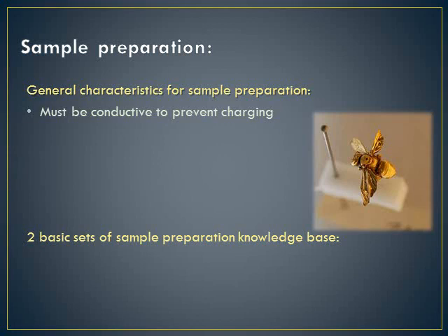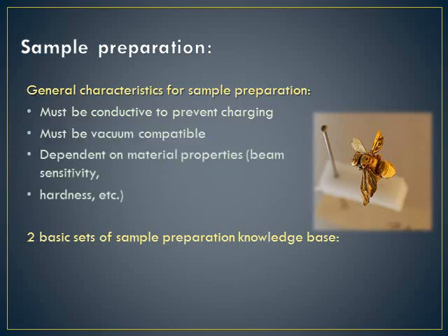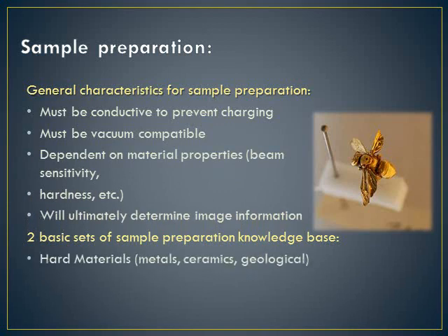Fixation is usually performed by incubation in a solution of a buffered chemical fixative, such as glutaraldehyde. Coating. Most samples will need to be coated to make them conductive. Carbon is the most common coating material because it is cheap and almost invisible to most X-rays. Gold or gold palladium is preferred if the sample has a very irregular surface and you are absolutely certain you will not need compositional analysis.